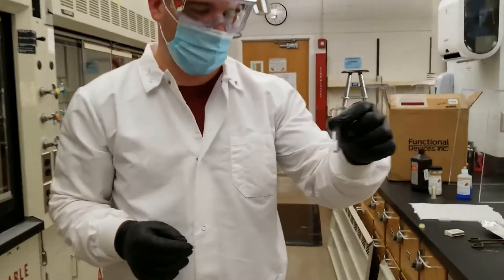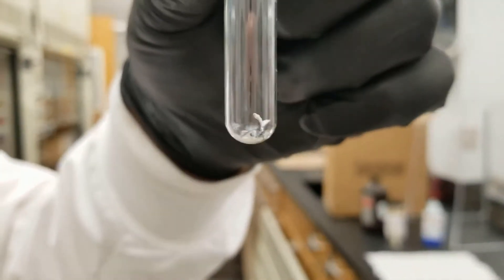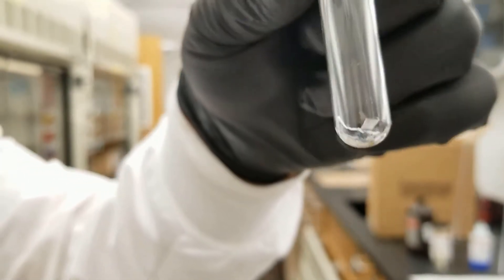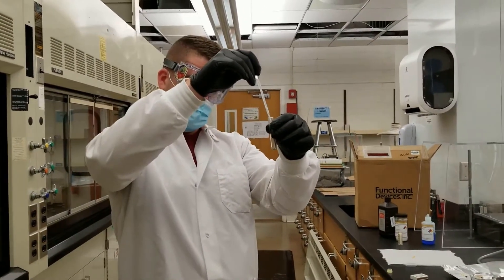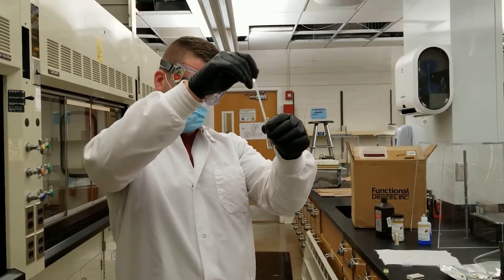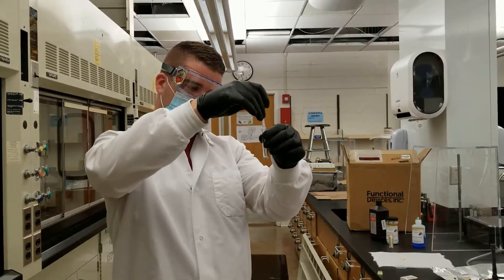So now you can see that from part A of test one, we have our magnesium and it's been burnt up. What I'm going to do now is I'm going to add four drops of water and I'm going to agitate it.